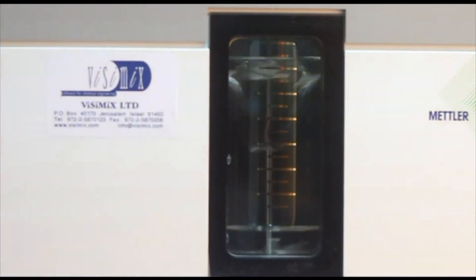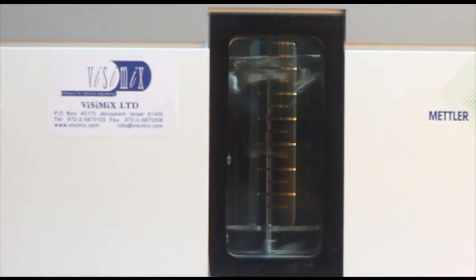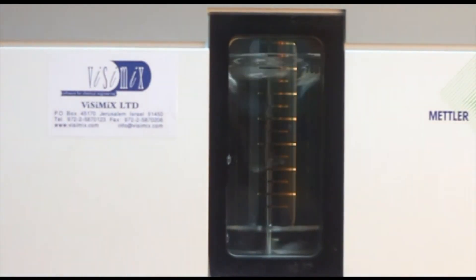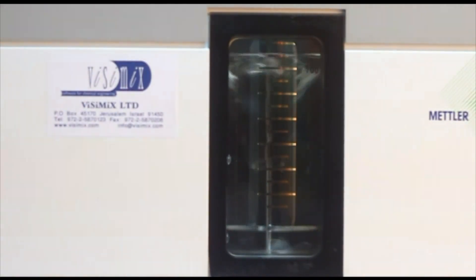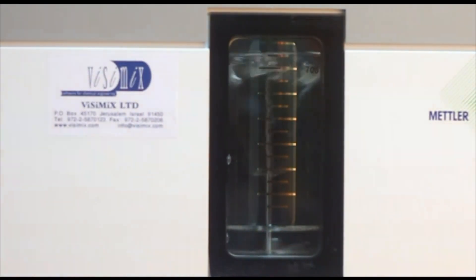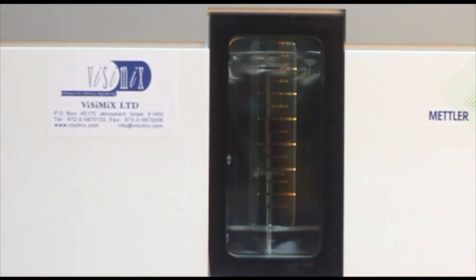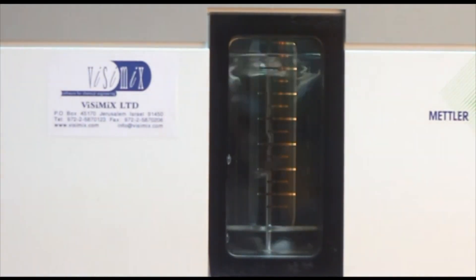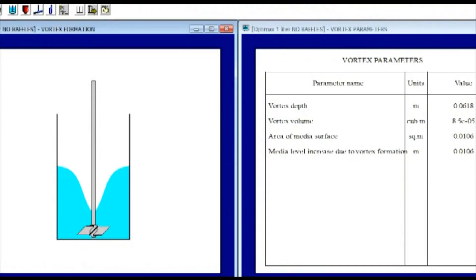What you will see is a progressive formation of a vortex as a function of increasing agitation revolutions. The media fed in the reactor is water at room temperature, fed at about 700 milliliters in a 1 liter reactor.